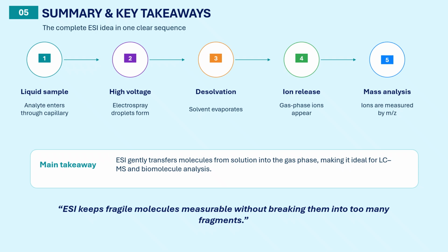In simple words, ESI keeps fragile molecules measurable without breaking them into too many fragments. This is why ESI is widely used in modern LC-MS systems, proteomics, metabolomics, and pharmaceutical analysis.